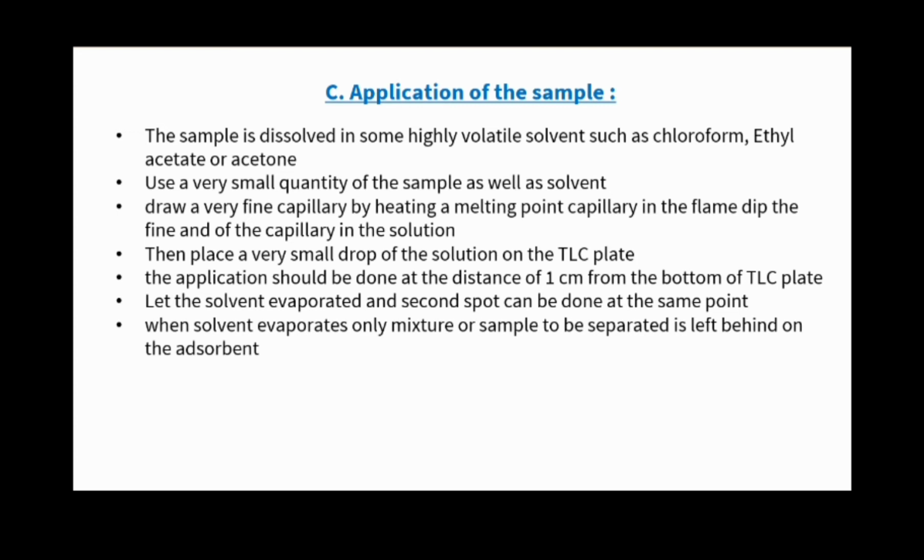After that draw a fine capillary by heating a melting point capillary in a flame. Dip the fine end of the capillary in the solution, then place a very small drop of the solution on a TLC plate. The application should be done at a distance of 1 cm from the bottom of the TLC plate. Let the solvent evaporate and a second spot can be applied at the same point.